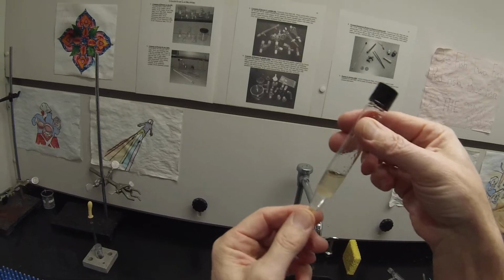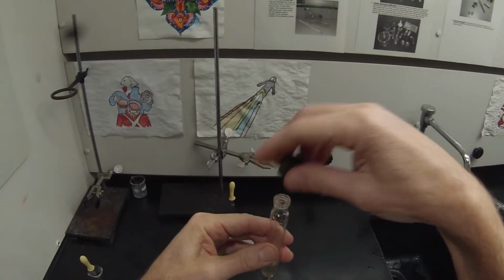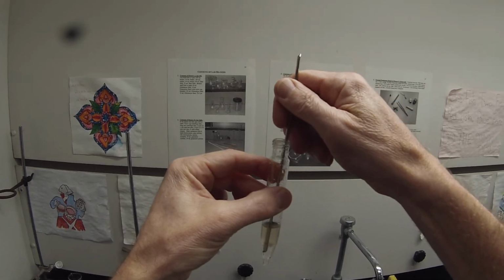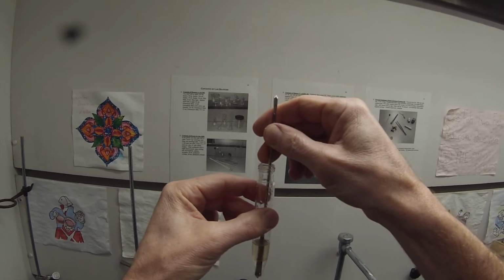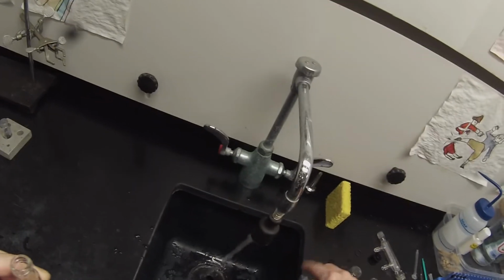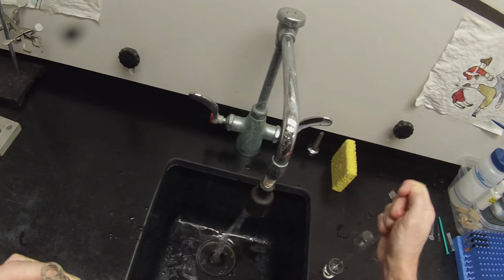If you look at that carefully, you can see that there's still a little bit of mixture, a little bit of bubbling. I'm going to break up some of those bubbles by reaching in with the little spatula. Let's give it a gentle stir at the interface to try to get those bubbles of ester out of the water layer. So I don't get any carryover acid. Rinse my pipette a couple of times in water.